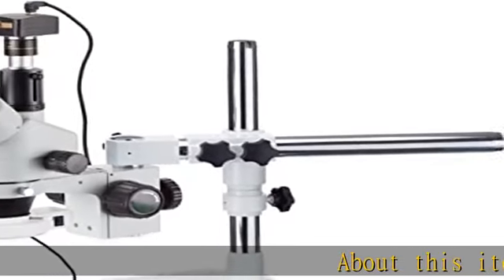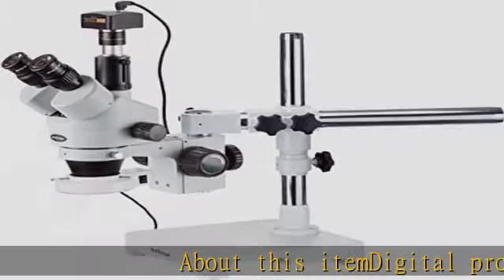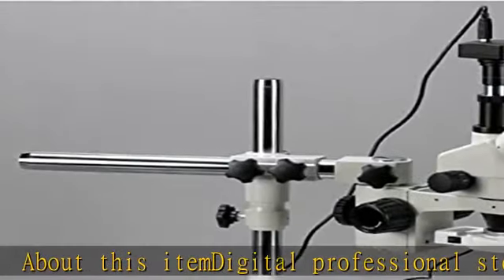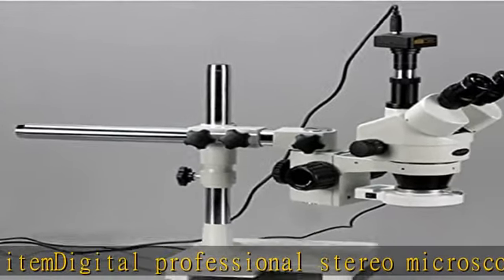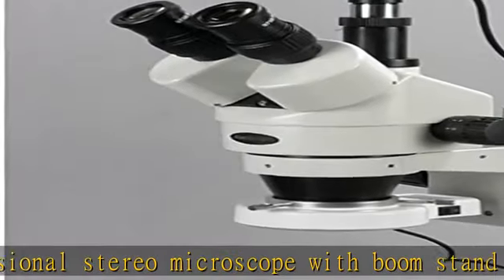About this item: Digital Professional Stereo Microscope with Boomstand has long working distance to enable users to perform work or manipulate large items, including circuit boards and dental appliances.